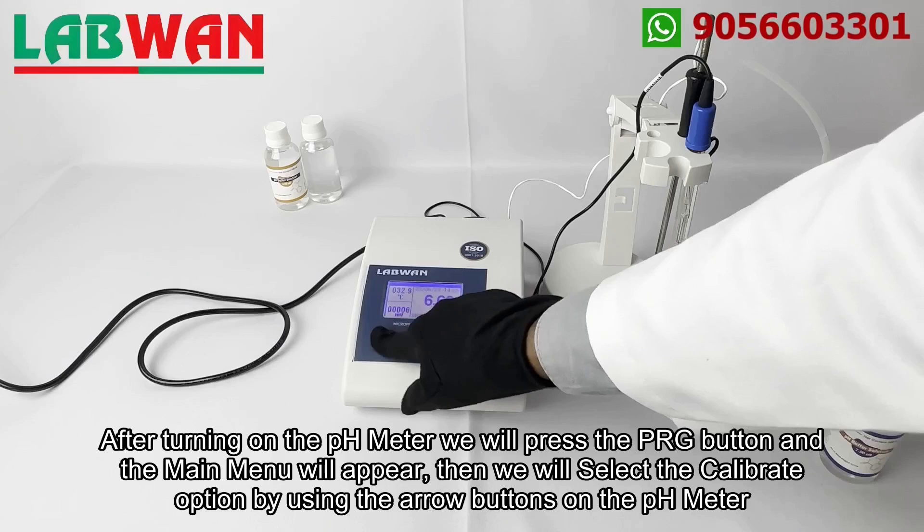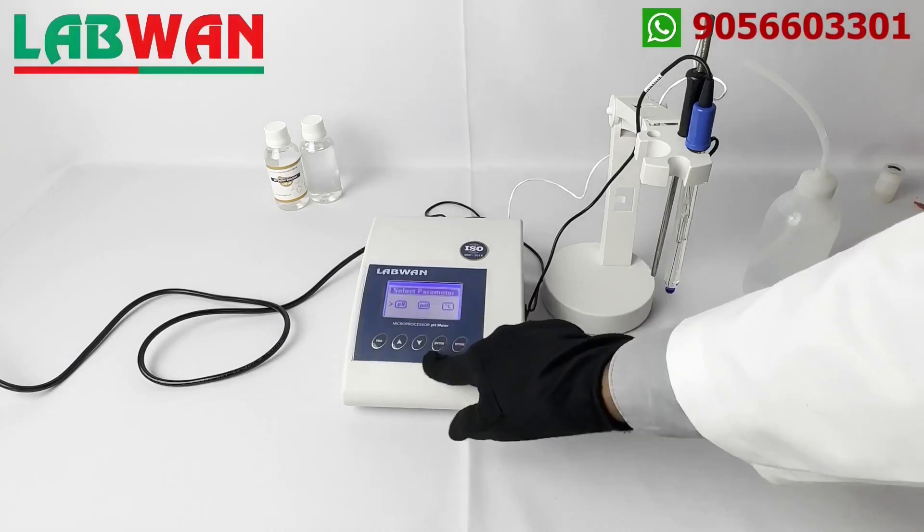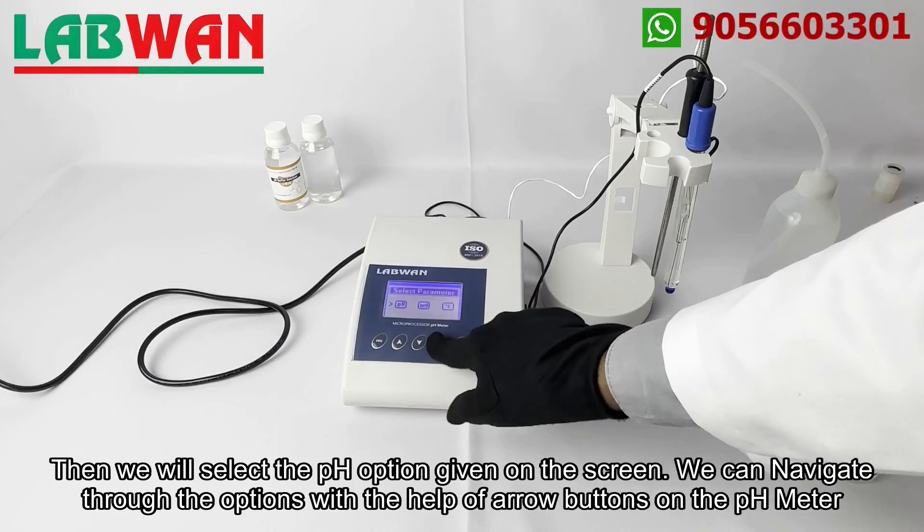We will select the calibrate option by using the arrow buttons on the pH meter, then we will select the pH option given on the screen. We can navigate through the options with the help of arrow buttons on the pH meter.